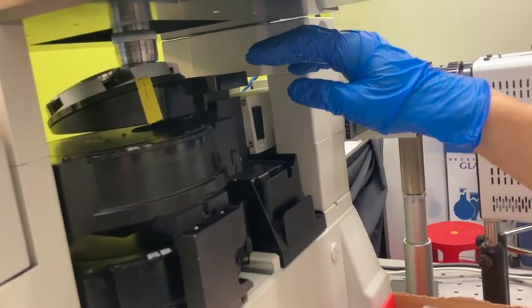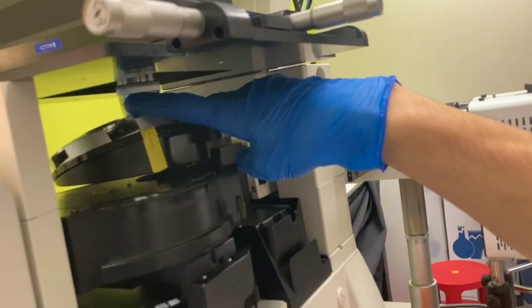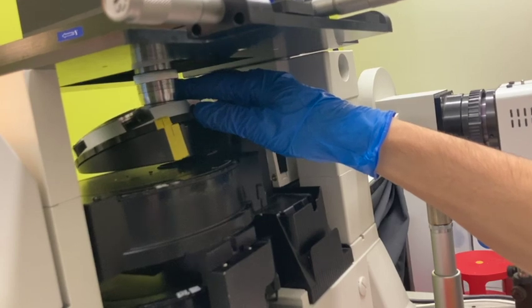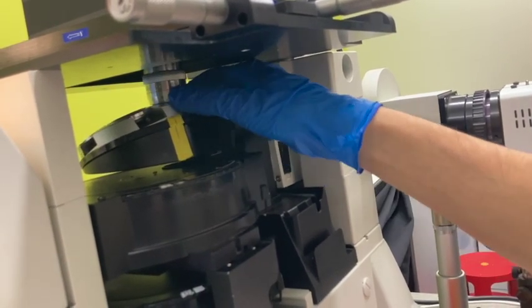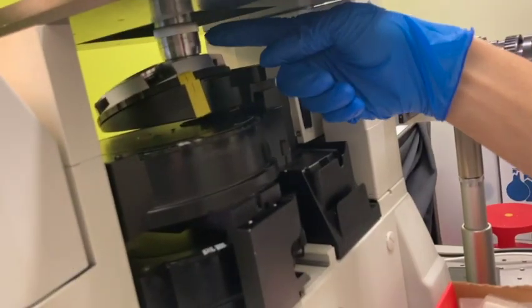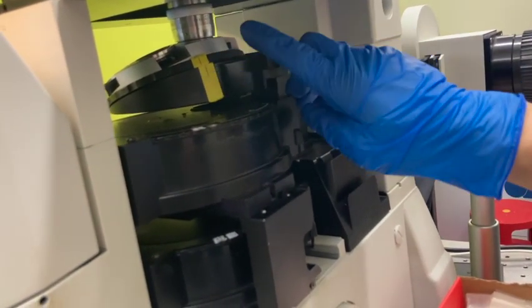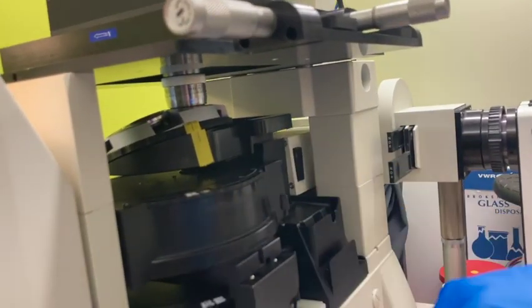It's possible that when you move the stage, it will push the objective to move a little bit. I don't want to show it, but you can see it's movable. It's easy to move. So if you move the stage toward this direction, a far distance, it's going to push this, which means the objective is off alignment, and we have nothing there.